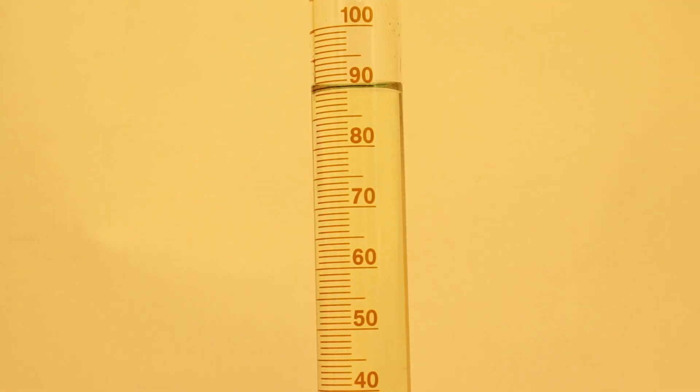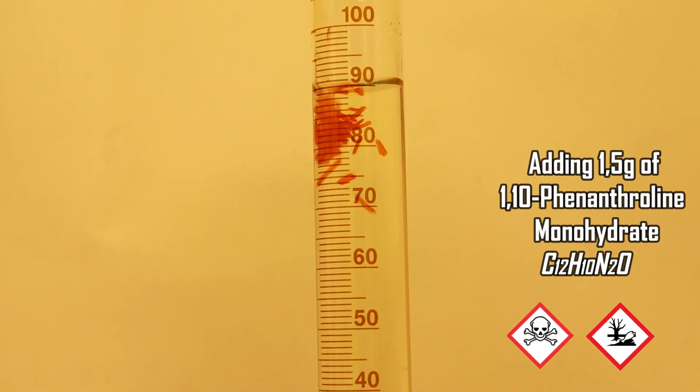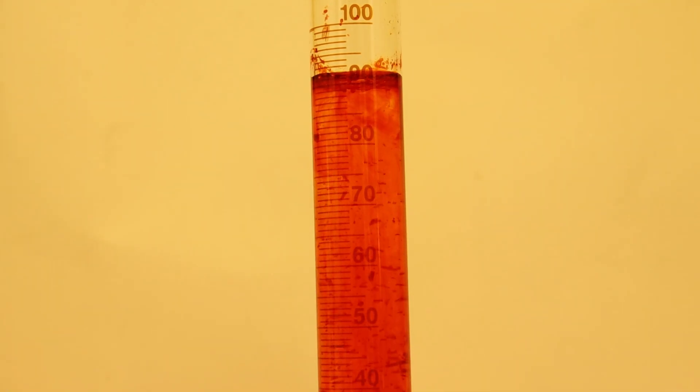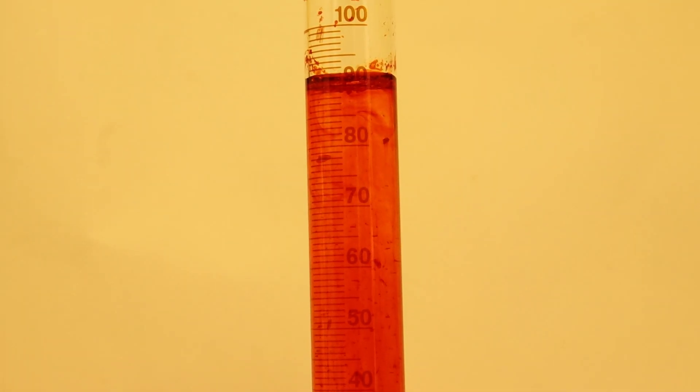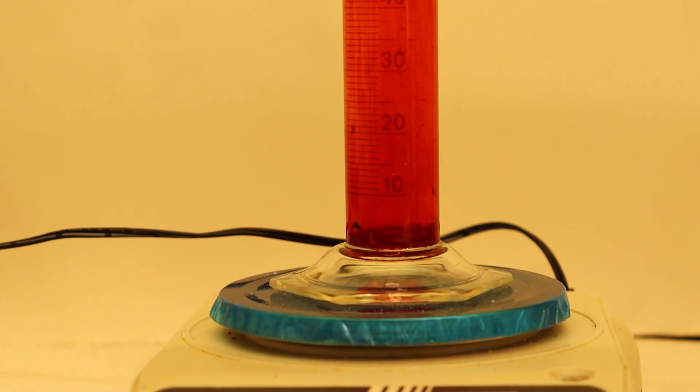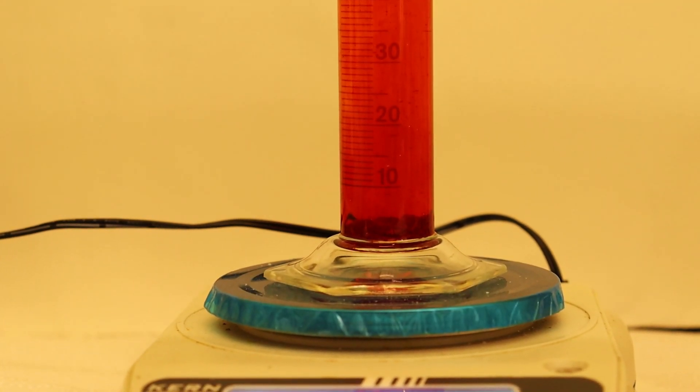Next it was time to add the phenanthroline to the sulfate solution. Immediately there was a blood red coloring as the ferroin was formed. All there was left to do was to wait for all the phenanthroline to dissolve, which took a surprisingly long time. Once it completely dissolved we moved the ferroin to a storage bottle and moved on to making the other solutions for the reaction.